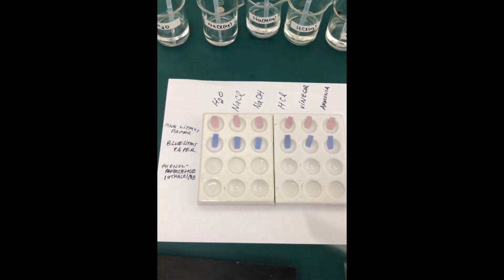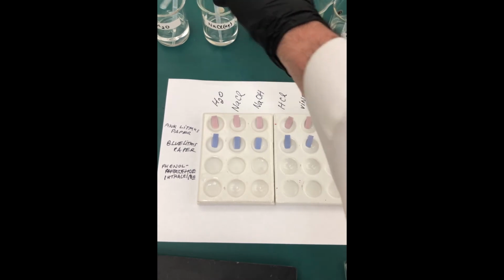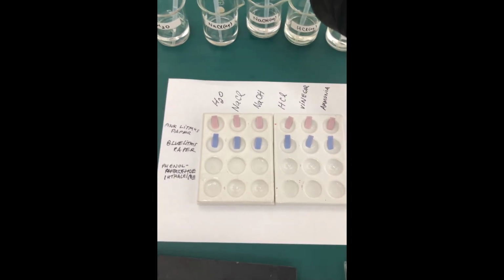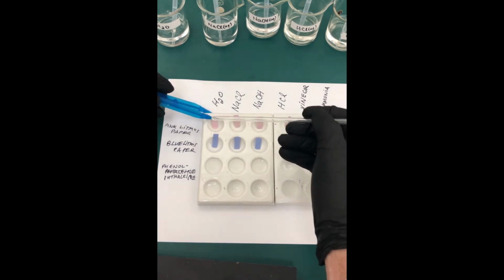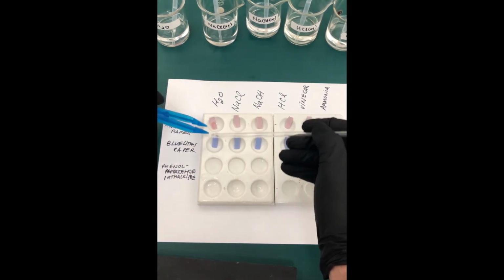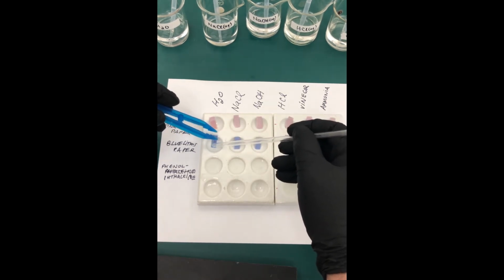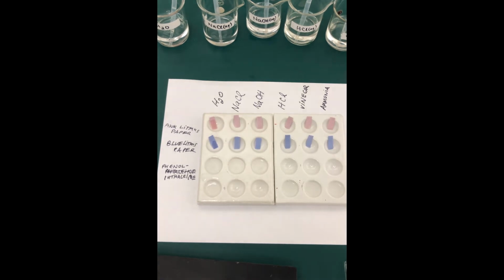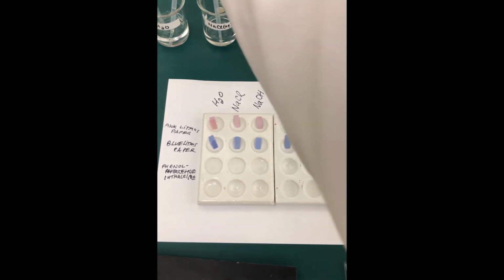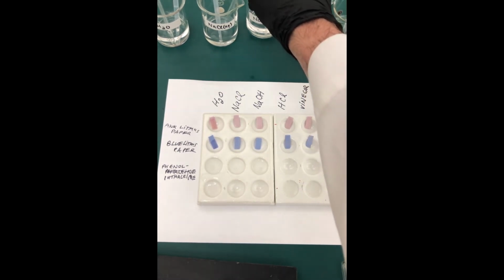So let's start out with the litmus paper. I'm going to start with water. And what I'm going to use is a stir rod to hold just a little drop. I'm going to put a drop here onto the pink litmus paper. And then we're going to put another drop against the blue litmus paper. And of course, the paper gets a little darker, but it doesn't change color. That's not what we're looking for.